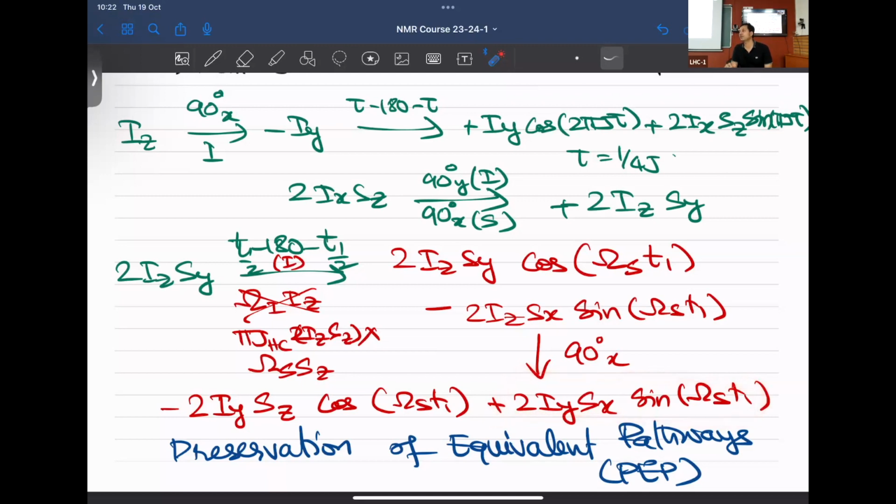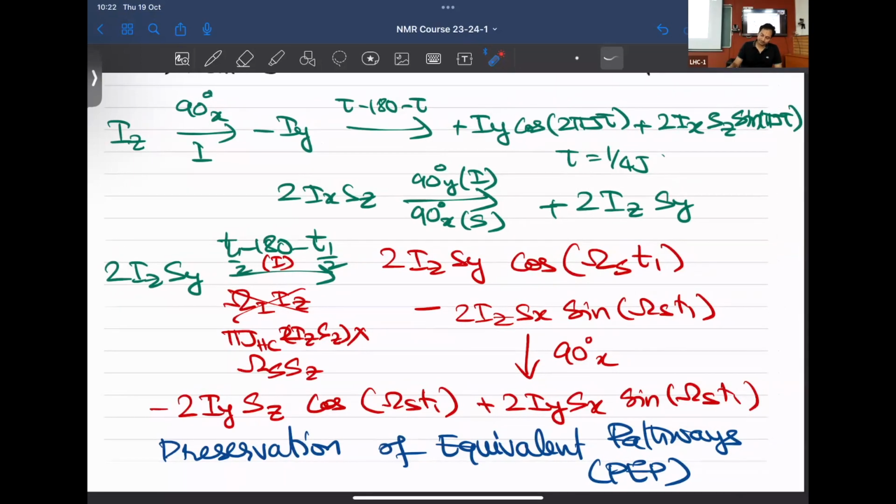So this is also important, but not for this experiment. You're not going to observe it given this pulse program. You have to change it a little bit to recover something from this also. If there are no questions, let's continue ahead.